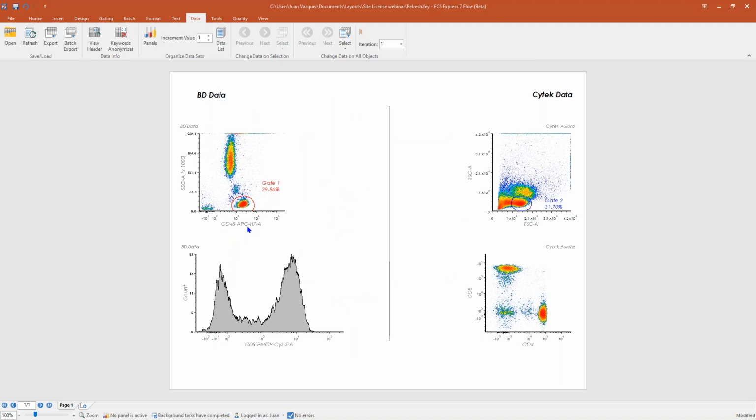And that new selection should kick in automatically. Okay, so not only does it extend to your axis labels, maybe you actually want to change the scaling that's being displayed. Maybe rather than see a 4 million range scale on forward scatter, maybe you actually want to truncate that down to 256 or something. It's the same idea. We can actually come in.